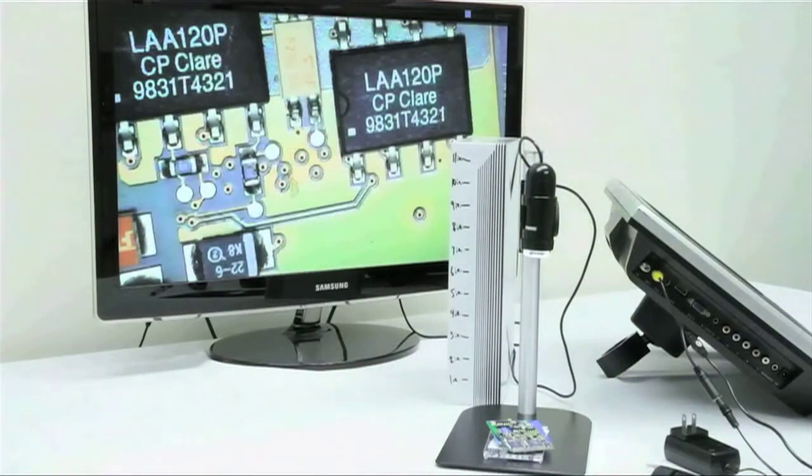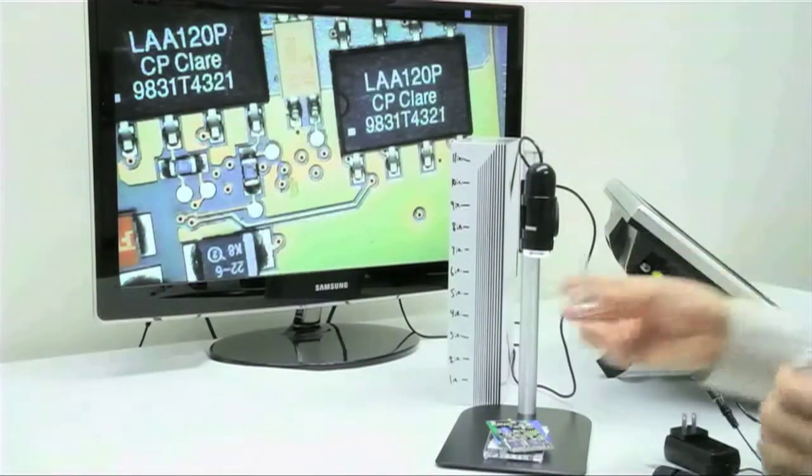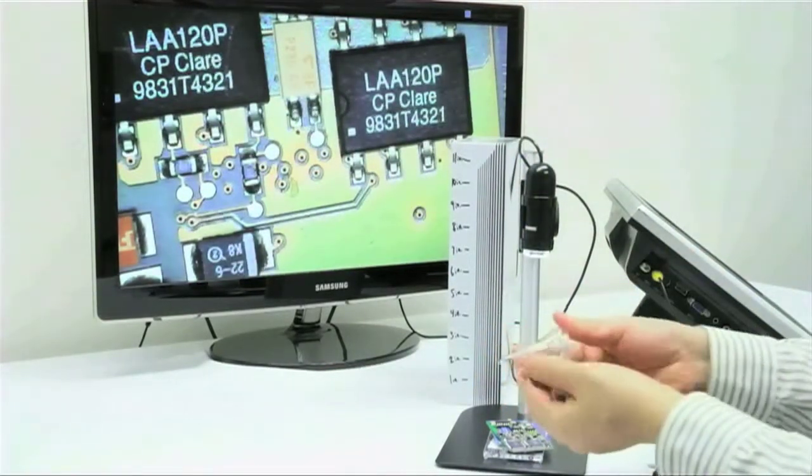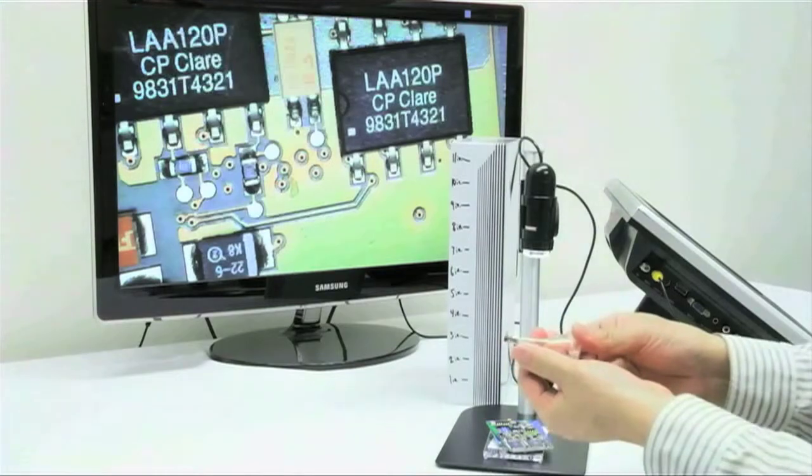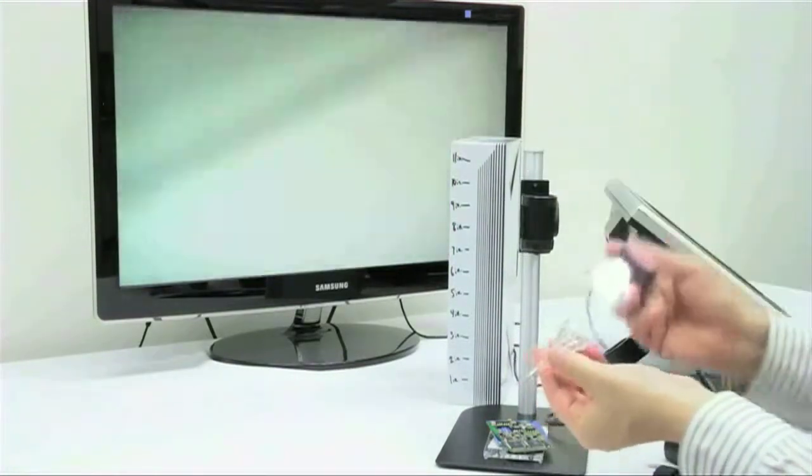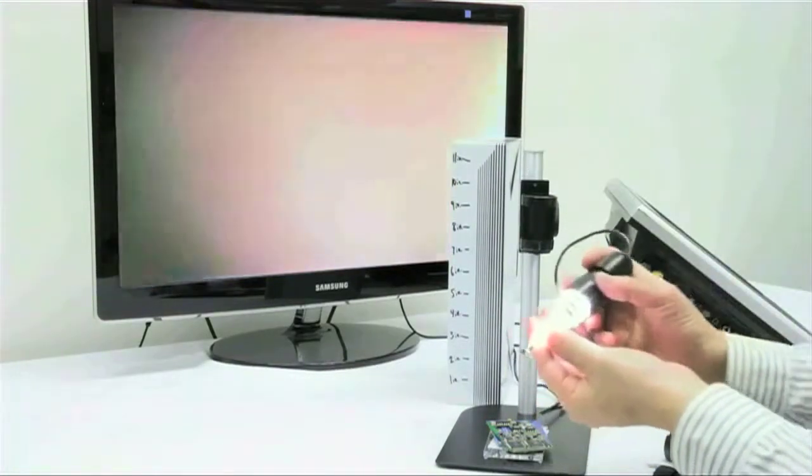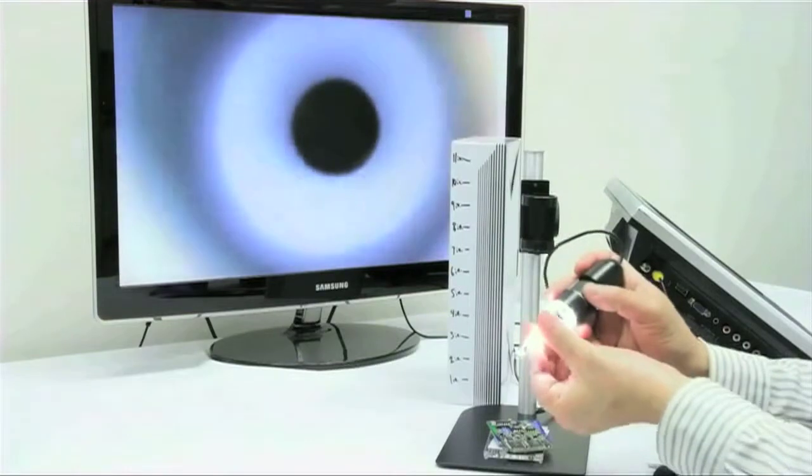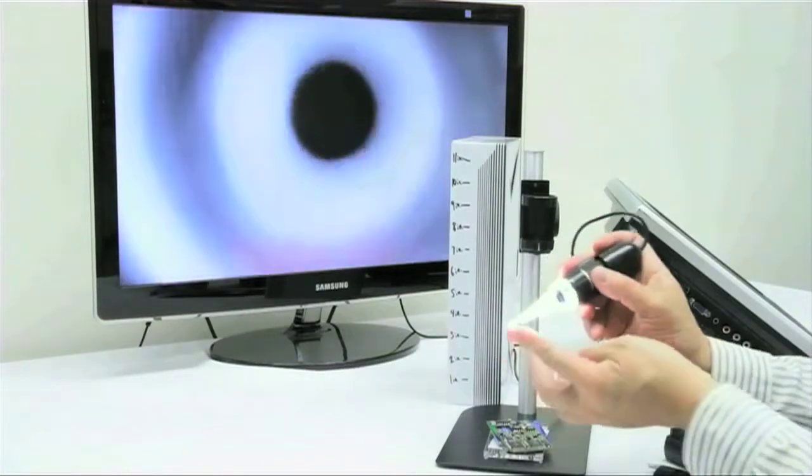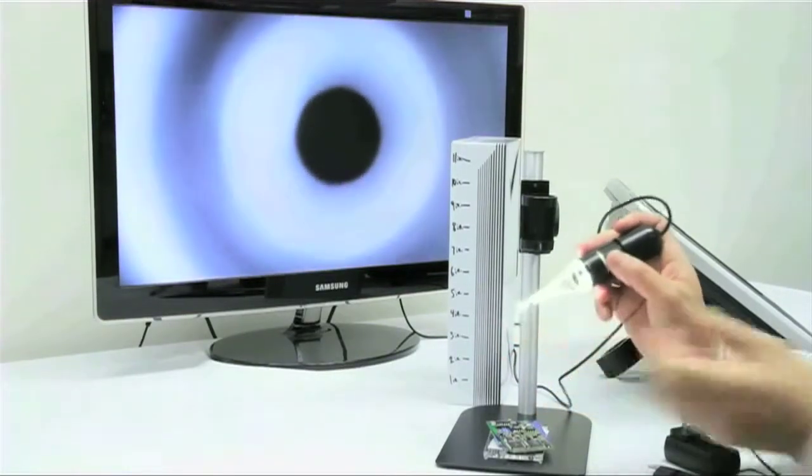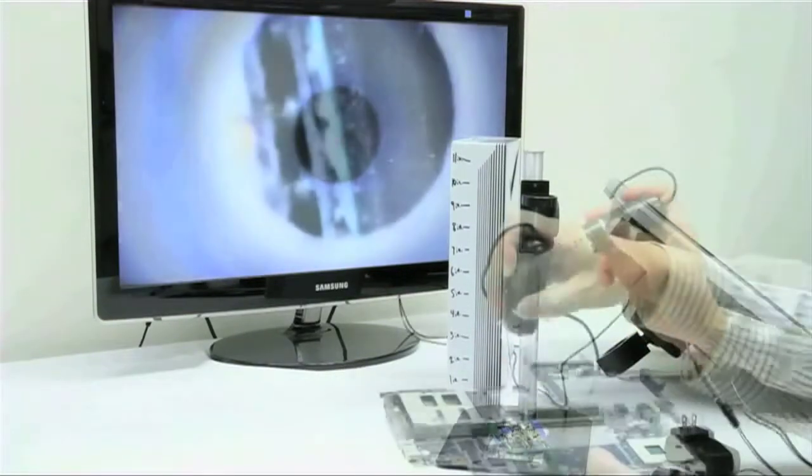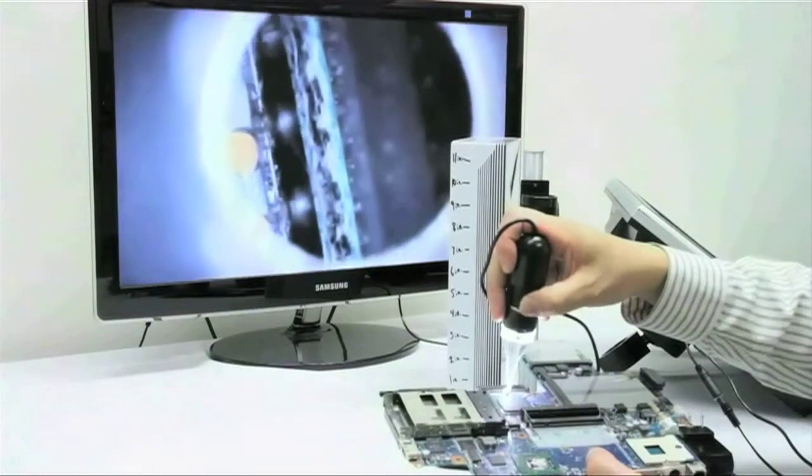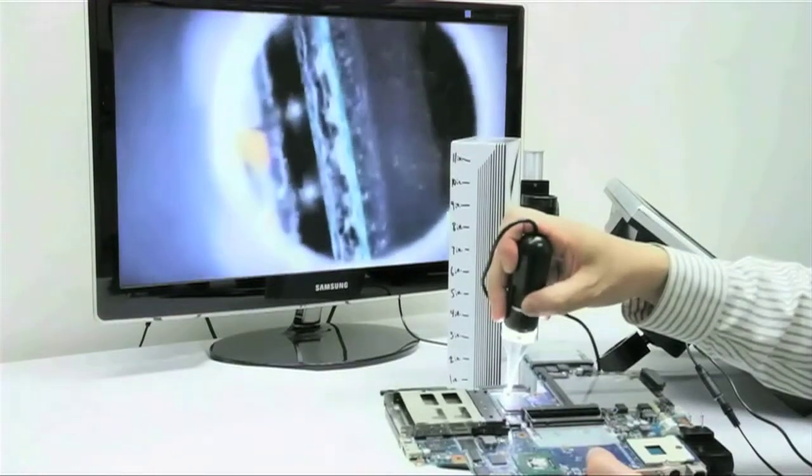Having a removable front cap allows you some different options of front nozzle attachments. Here we have a 90 degree angle viewer attachment that works exclusively with the L series. This is great in the dentistry field as well as many others.